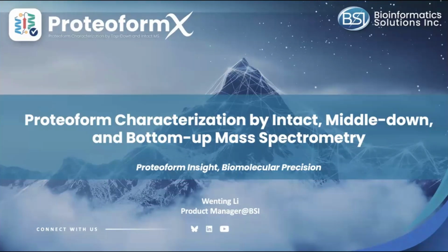We will cover core concepts, the key functions, the supported biologic modalities, and advanced features to help you achieve molecular precision in proteomics and biopharma development. I will also show how ProteoformX integrates these workflows into a single platform, followed by a demo walkthrough.